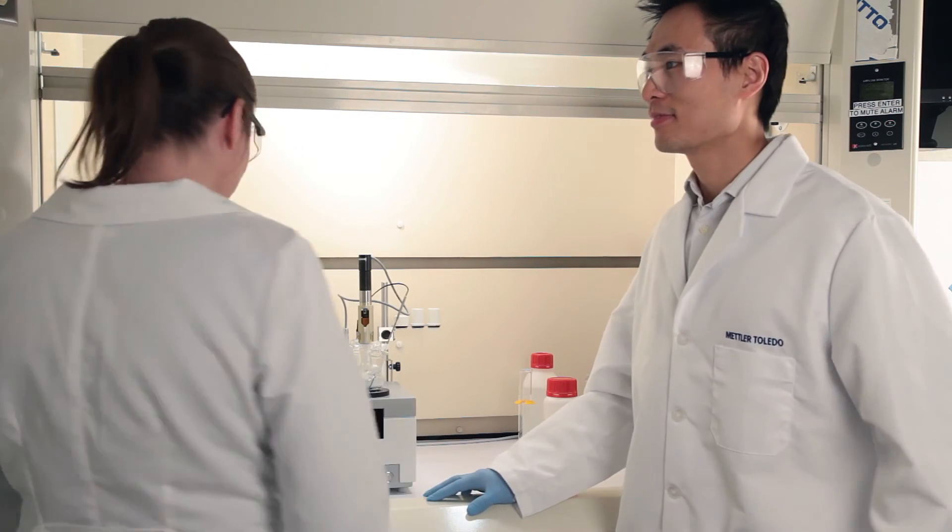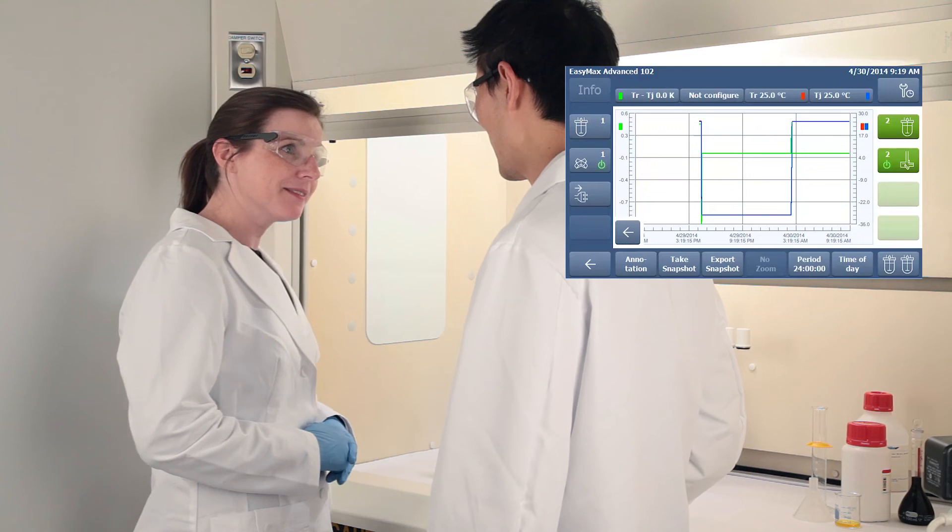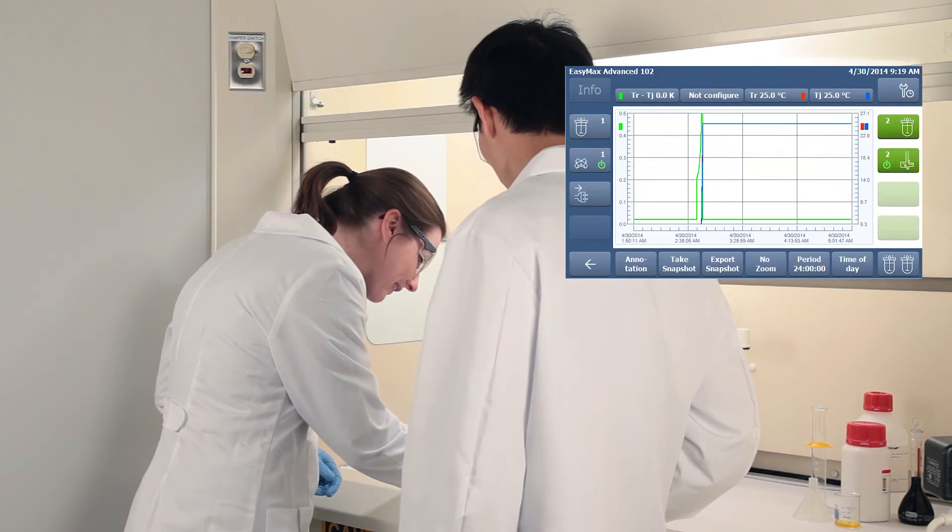Communicating with customers or colleagues is simplified by capturing all reaction conditions trended over time, making it easy to share reports or repeat identical experiments in the future.